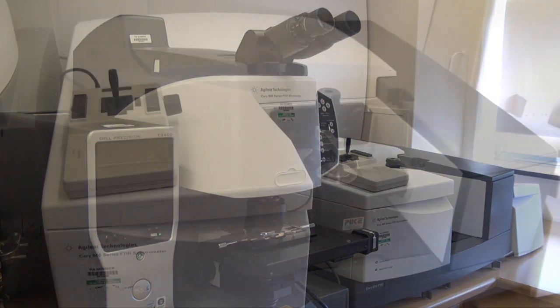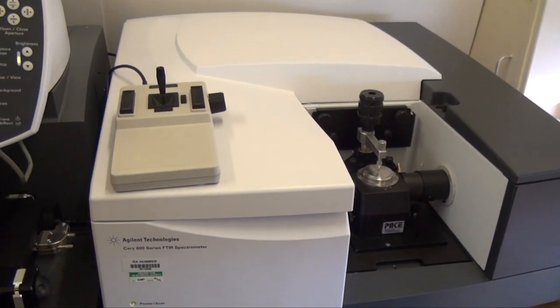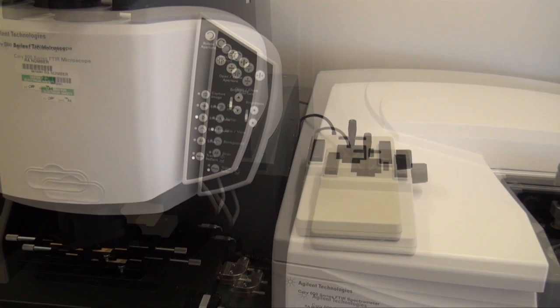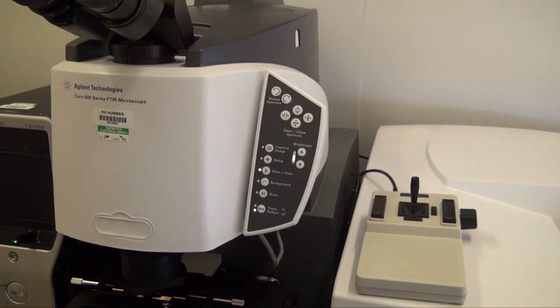FTIR spectroscopy is an extremely versatile analytical tool which can be used to analyze a wide range of organic materials, and some inorganics as well.